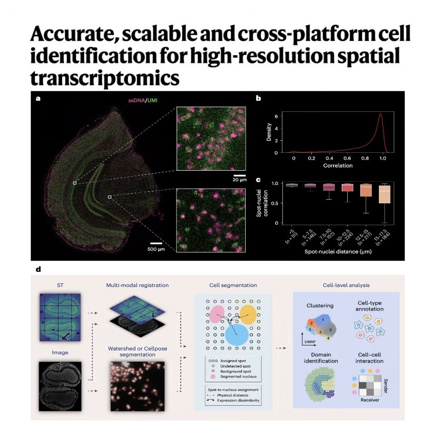Okay, fair enough. So how exactly does it calculate both things at once? It balances them using a hyperparameter called alpha.